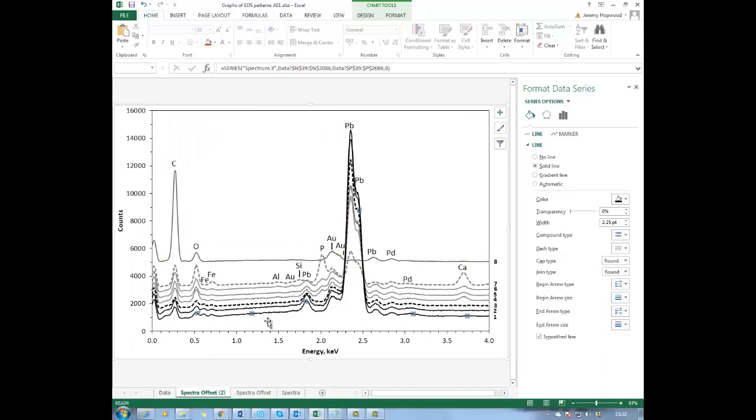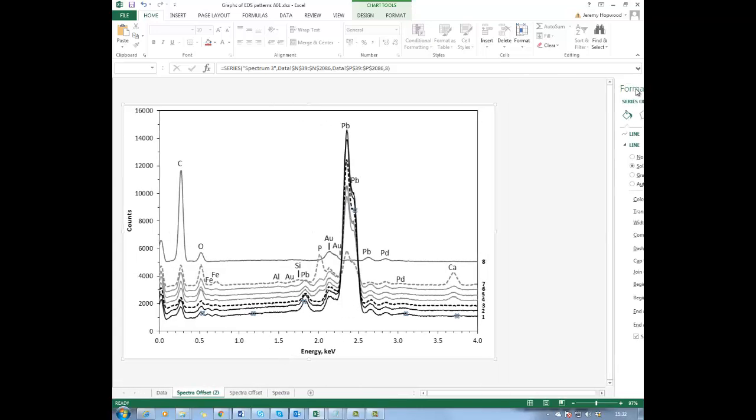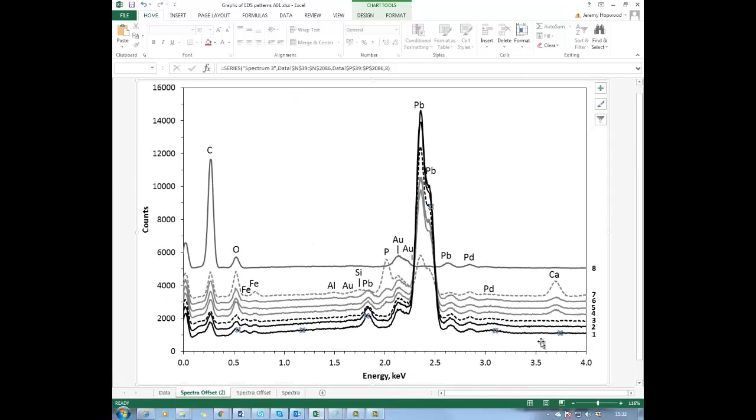The first two I did black, and then I did a dotted line. This was because of the layers, because 1 and 2 in this particular case I think were part of the lead metal, and then 3 was on its own, and 4, 5 and 6, and 7 was in the outer layer, and then you had the grey.